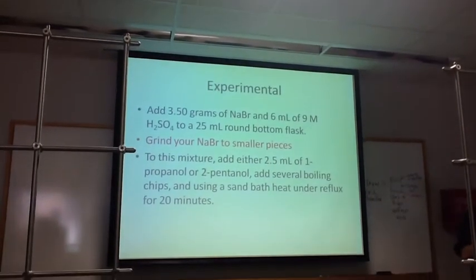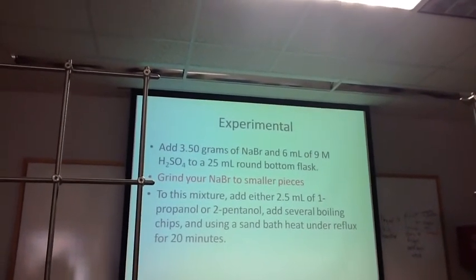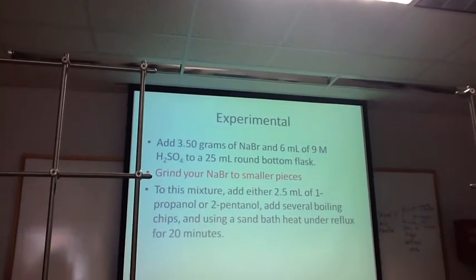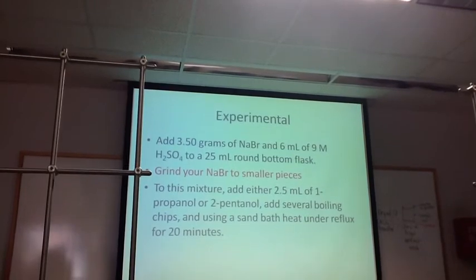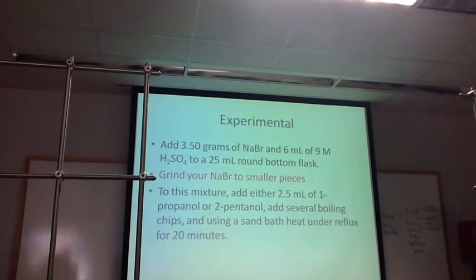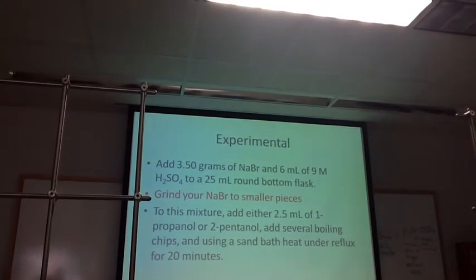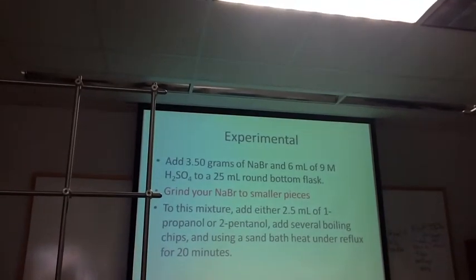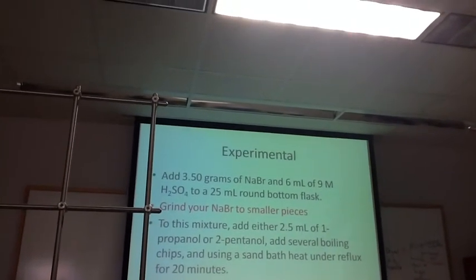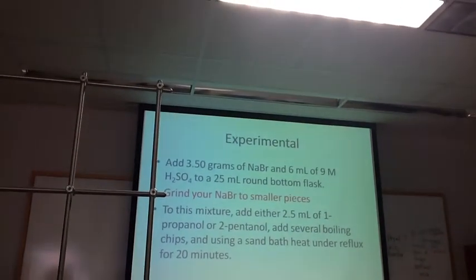And then we'll tell you which ones we want you to do. Like she said, half of you will do the pentanol, half of you do the propanol experiment, and then next week we'll make sure that you have all the data for everybody when you leave. So that way, if you do pentanol, you'll get somebody else's propanol data at the end of next week. So you also need to make sure that you add boiling chips because we will be doing distillation and reflux today. So that'll keep it from bumping. So you don't want anything shooting out of your apparatus there. And we'll be using the sand bath to do a reflux there. So, all right.